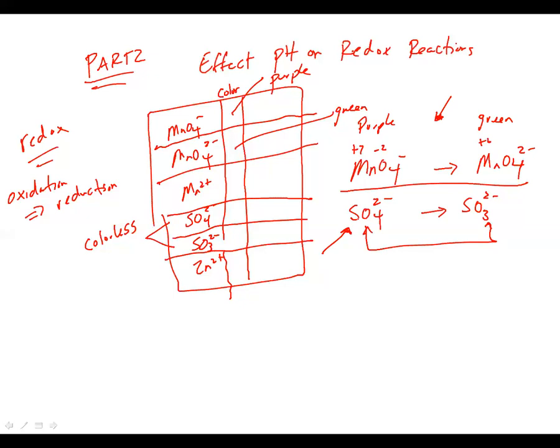So you are adding, for example, I think in part 2, you're actually adding, I have this flipped, you're adding sulfite. So this would be sort of one of your reagents, for example, and let's just say you added MnO4 minus. You're going to add it with some other stuff as well, but these are sort of your 2 reagents that occurred. Again, you're only going to be able to kind of see the color change occurring for the Mn.